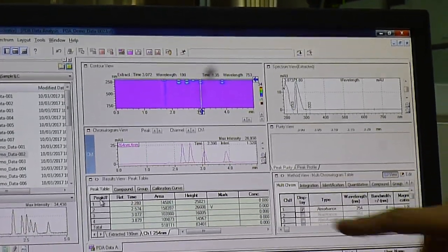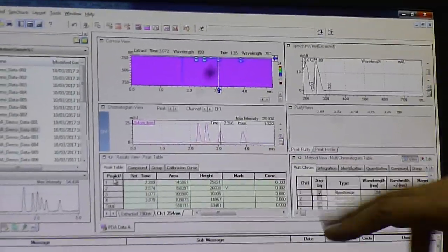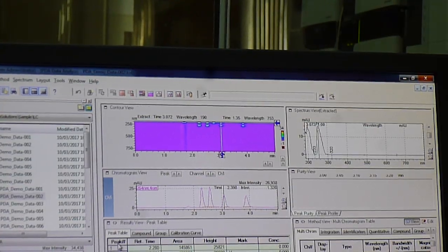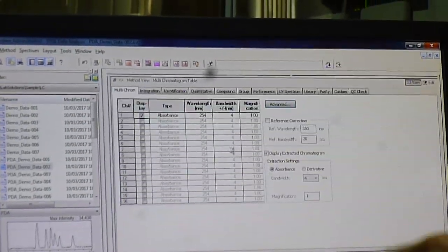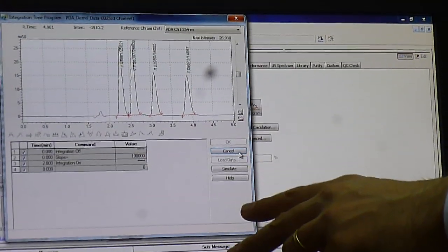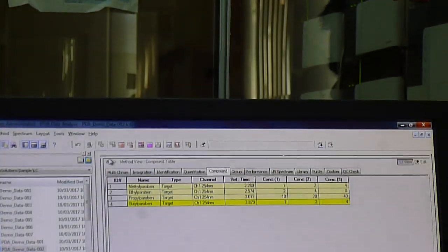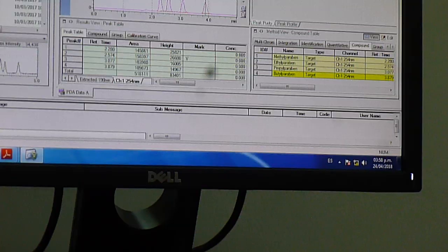And all of these parameters you see we changed in Wizard, we will save in the method file too. Okay? So we will apply these parameters, the wavelength, the integration parameters, this window, this information, I will save in a method file. I will apply to the method file with the button.